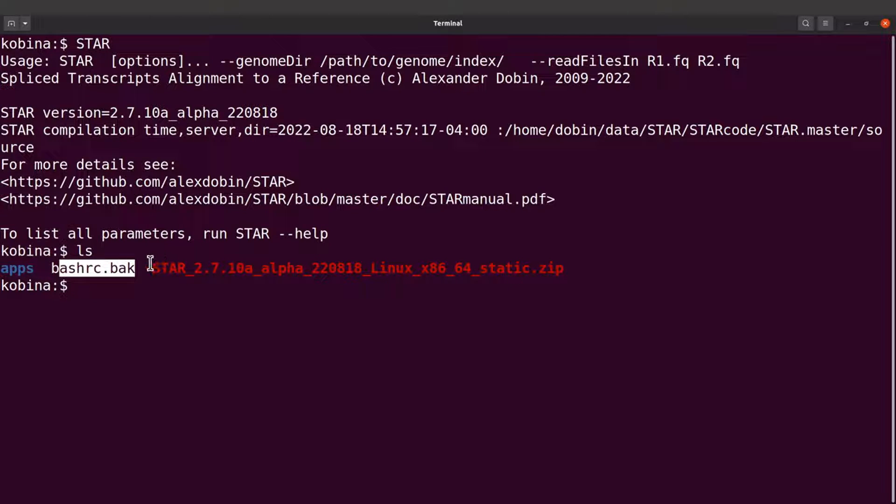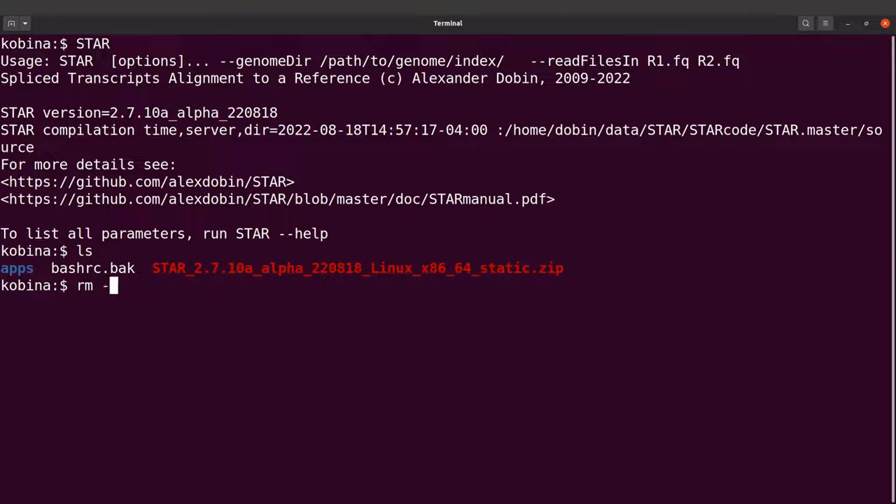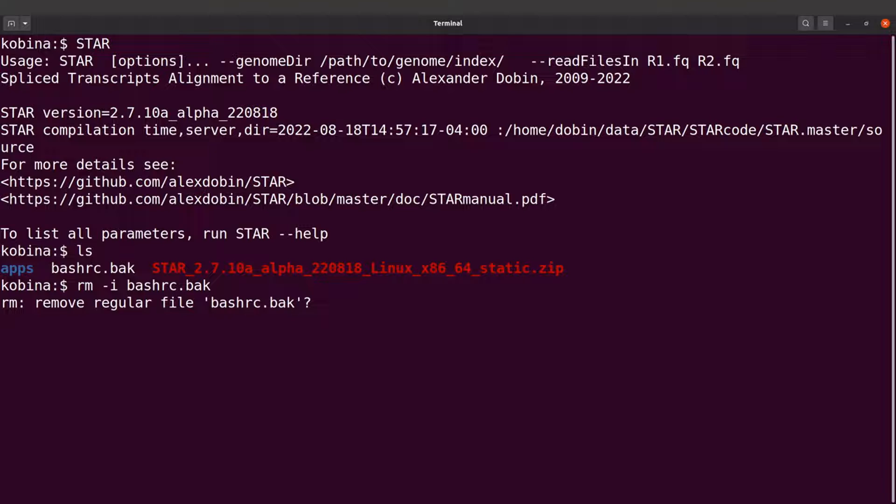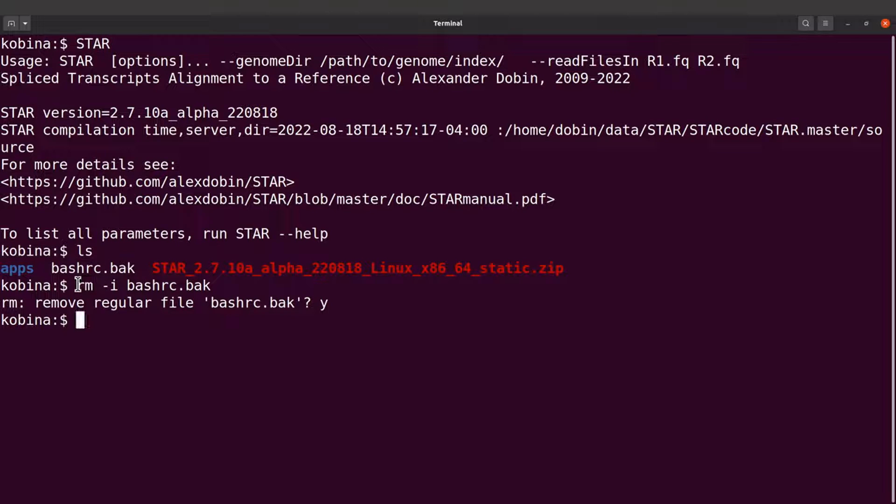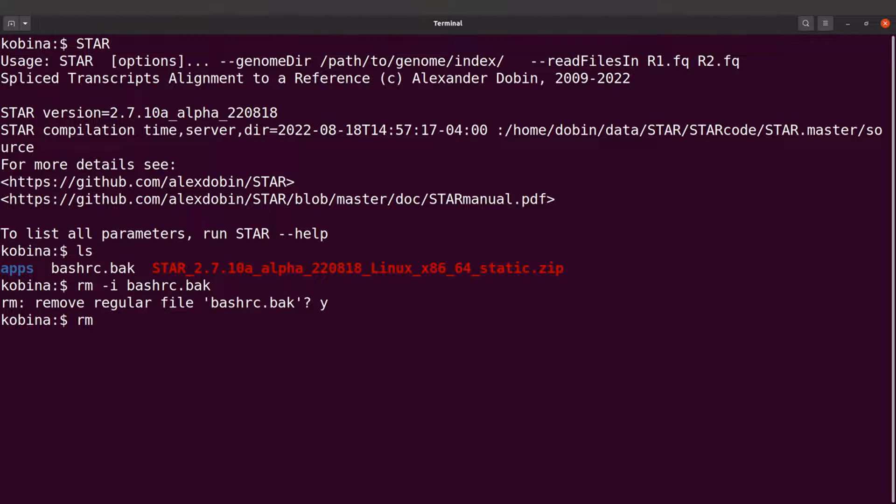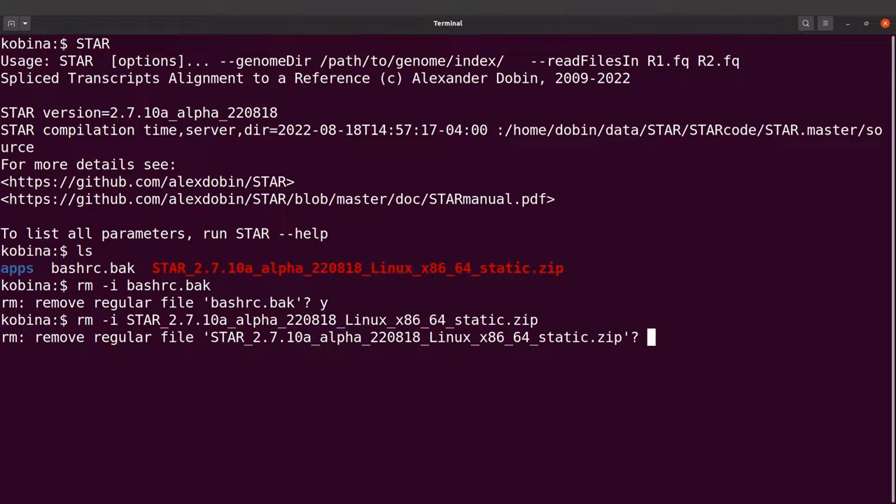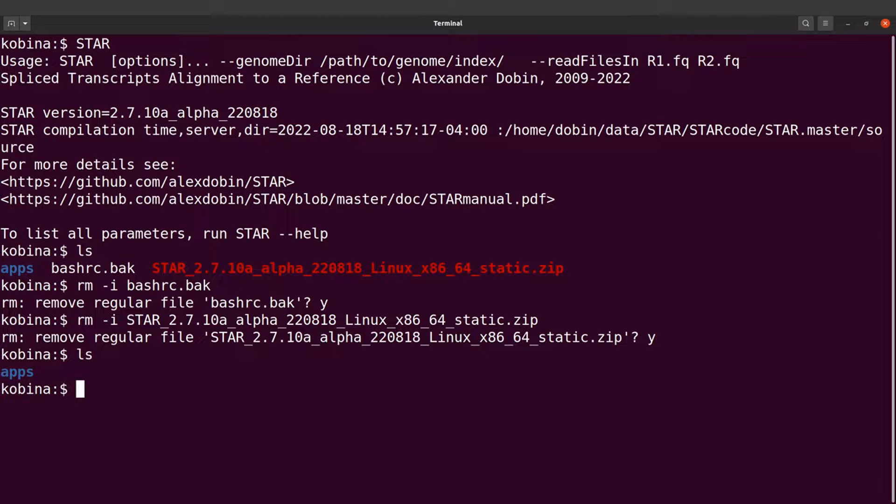You'll see bashrc.bak and then this STAR zip file. You can choose to leave them, but I'll prefer to remove them. I'll start with this one here, so I'll say rm dash i and then I'll specify the name. So the dash i will let me confirm. The rm command is used to remove files, and whatever you do is irreversible, so you have to be careful when using the rm command. I'll do the same for the zip file. So I'll say rm dash i and then I'll specify the name. I'll confirm, so now it's done.